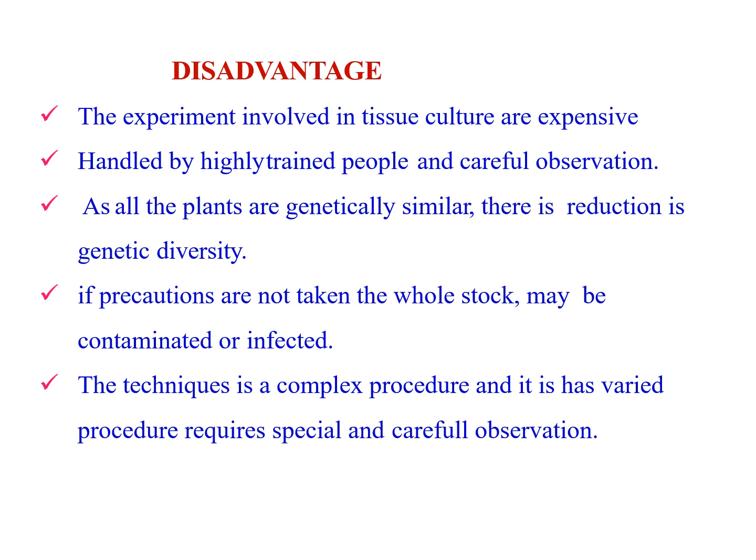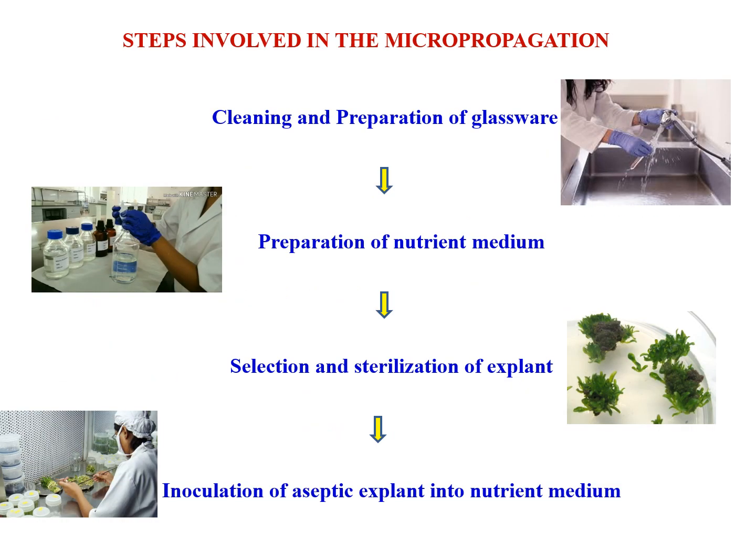Also, plant tissue culture is a complex procedure. It has varied procedures that require special as well as careful observations. What the techniques, steps, or complex procedures are, we can see in the next two coming slides.